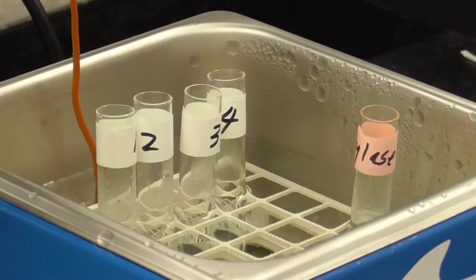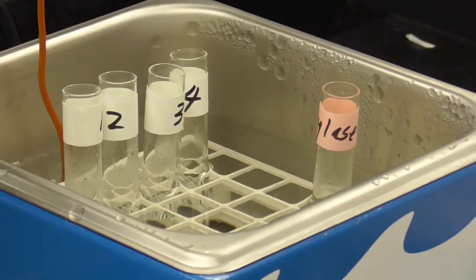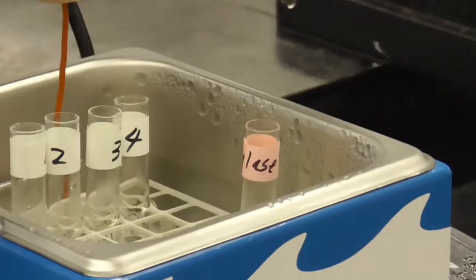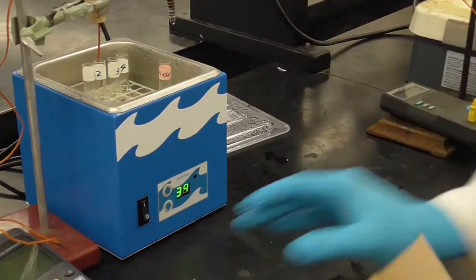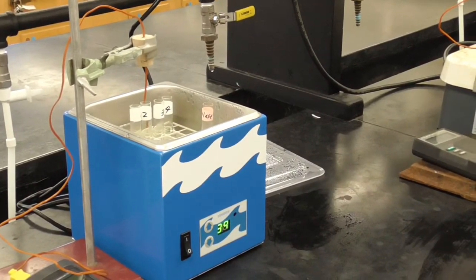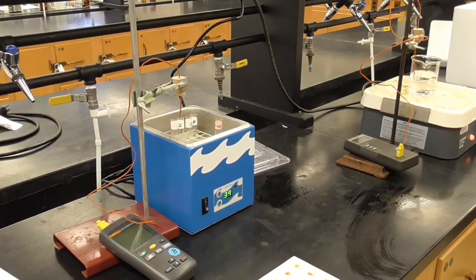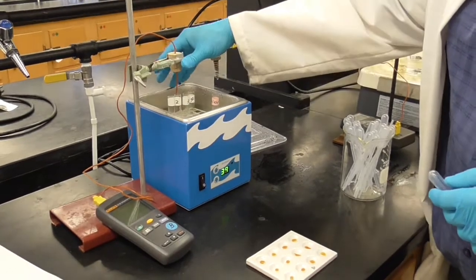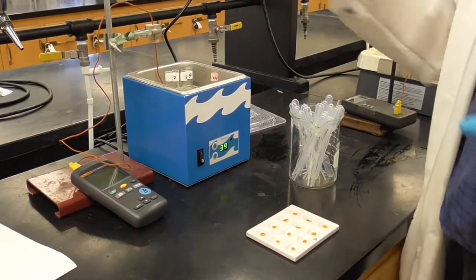I'm going to bring that test plate over here. That might be a little easier. I won't have to run back and forth on the lab bench. I'm just going to push this back a little more, give myself some room here. I'll get the test plate and bring that over. Wipe this down. We should be ready to go then. Let's bring my droppers over. For the amylase, I'm going to do this right here in the water bath. I'll move my temperature probe back a little bit so I have more room. Hopefully, can you see what I'm doing on the camera?